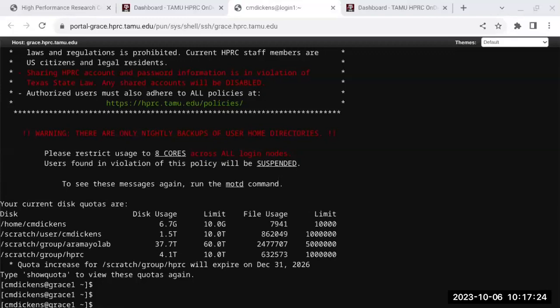Okay, I'm going to talk about some sequencing technologies, and then we'll look at some sample data. So this is just a list of some of the DNA sequencing technologies. Notice the HiSeq's not up here. The manufacturing has been retired for the newer sequencers, but there are still HiSeq sequencers out there.